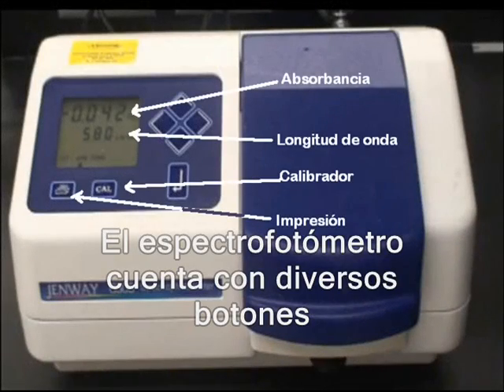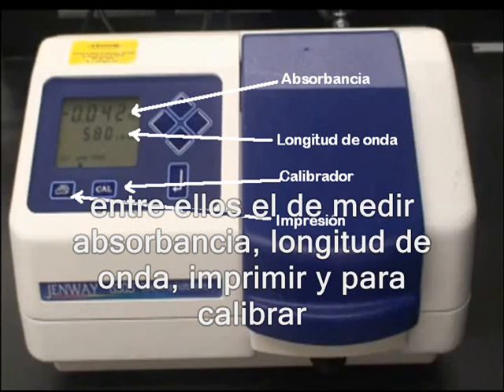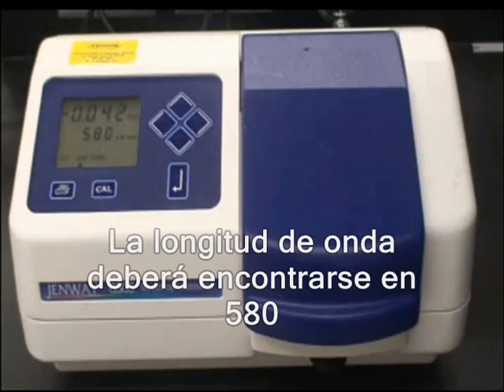Seen here are some common buttons on spectrophotometers. The wavelength of light, currently set at 580 nm, can be adjusted with the arrows.